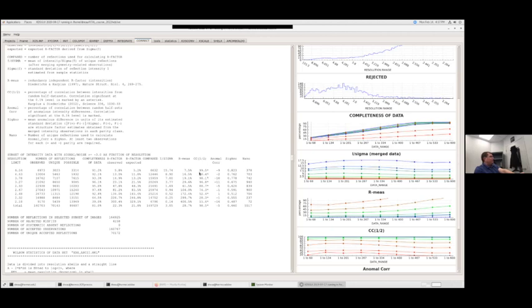Okay. As far as resolution cutoffs for XDS, what you want to look at is the CC 1/2. This is expressed as a percentage. And what it's comparing is it's split the data into two separate data sets and then doing a cross correlation. And so the statistics tell us that if we're above 30%, and there's some debate over whether it's 30%, 50%, or maybe even a little bit lower, that we should consider that statistically significant and therefore include that data.